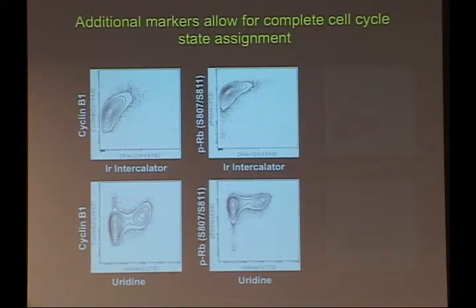One of the standard ways for doing this with regular flow cytometry is staining total RNA with pyronin. So Hoechst pyronin is probably one of the more standard techniques. The problem is that RB phosphorylation is generally considered a G1/S checkpoint or response. However, there's recently published work saying that the phosphorylation at serines 807 and 811 actually correlated with the G0, G1 transition. And so we investigated that, and we could get good resolution of that marker, and ultimately we were able to use it as that kind of marker.